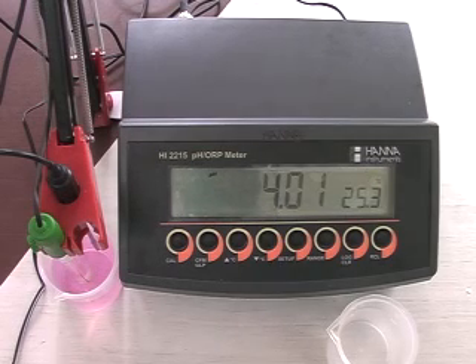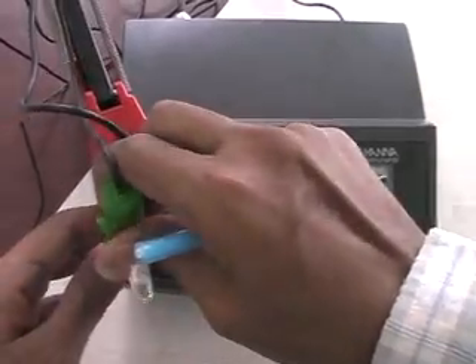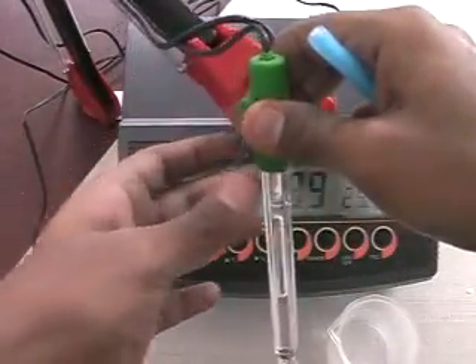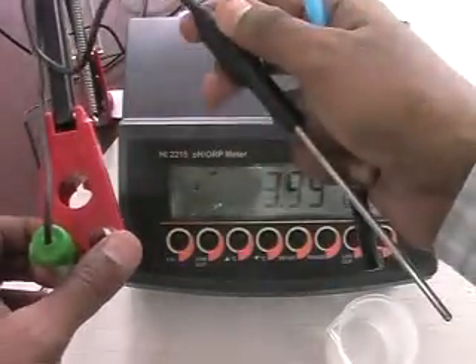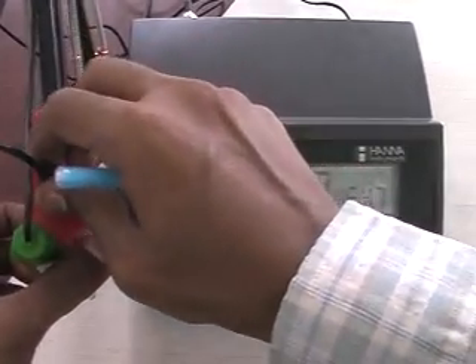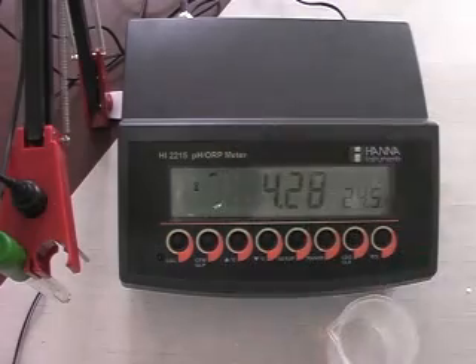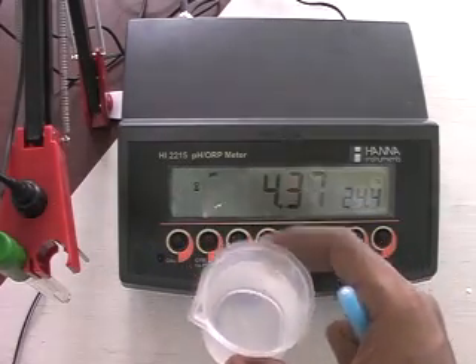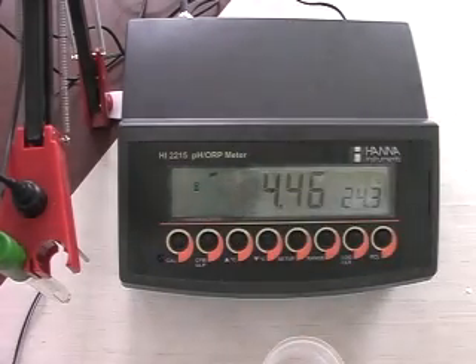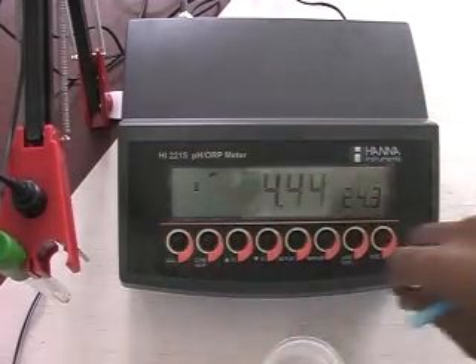First, check all the required accessories. Make sure that your electrode and the temperature probe is connected to the meter. Connect the pH electrode and the temperature probe to the meter. Then take pH 7.01 buffer sample, pH 4.01 buffer sample, and distilled water to clean the electrode. Make sure that all your buffer samples are fresh.